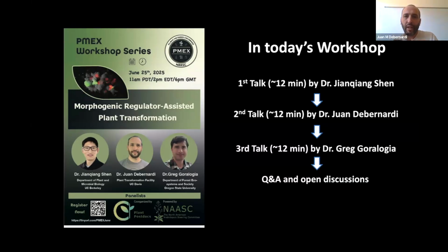So if it is up to me, I will test combinations and every tool that I have, and most of them are now available at Addgene. And the important thing that I will mention here is that we focus a lot on the morphogenic genes, but the Agrobacterium part, and I like Agrobacterium a lot, is very important too. Greg has a lot of tools there. The ternary vectors are a great tool too. So there are many other tools that help. That's my opinion.